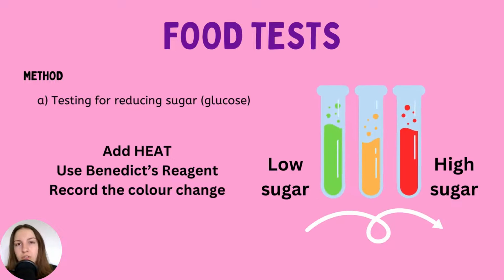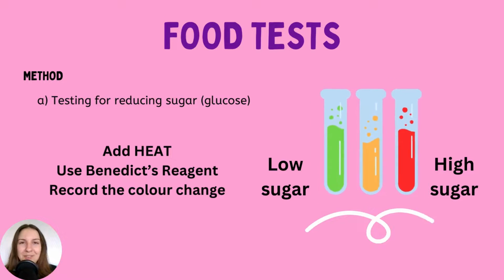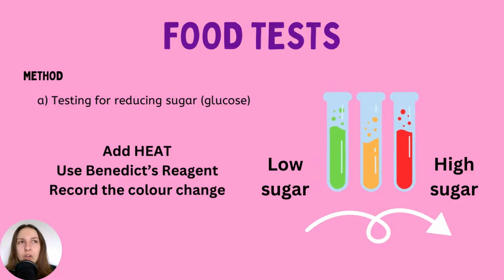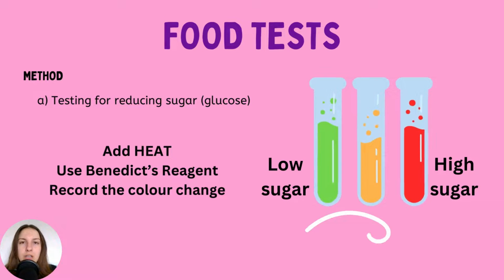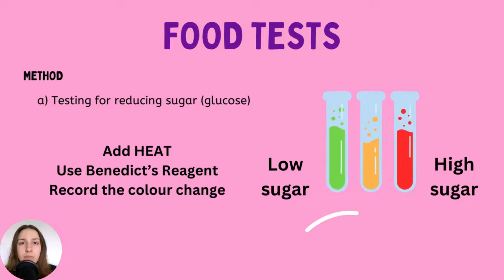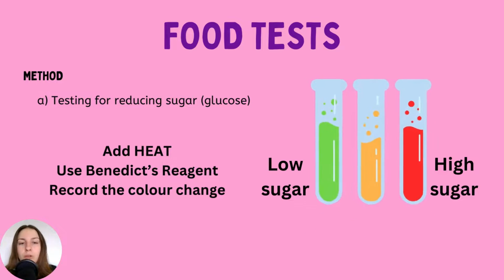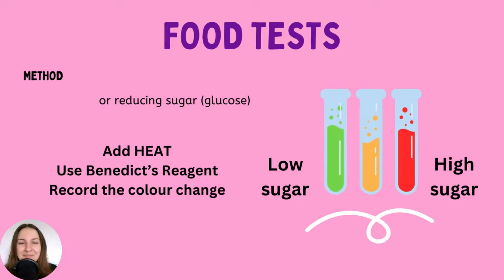And if there's no sugar, by the way, at all, absolutely none, which is quite unheard of these days with all the sugar that's in food. If there's none, you want to say that the reagent color, there is no color change. You could say it remains blue. That could be another way of saying it as well. So whichever you like to use.